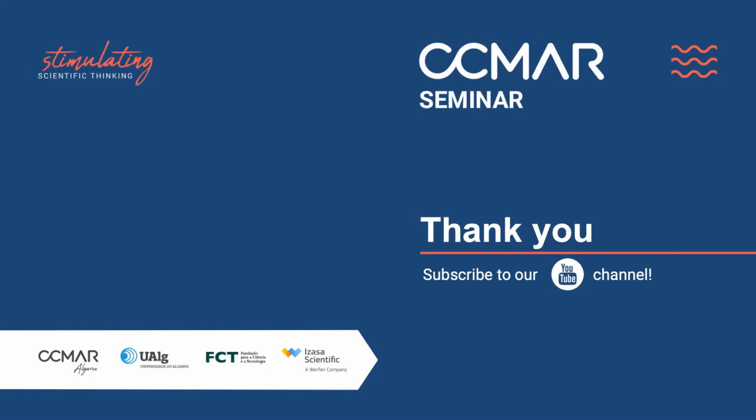Okay. I can imagine that it's quite painful with those complex samples. Okay, yes. Thank you very much. Yes, and another thing is that, when you process a natural sample, you always get particles from the environment. So it is also very difficult to process the sample in a very clean way so that you don't get your sample contaminated with fibers that are flying everywhere. That's another related problem. Okay, thank you.